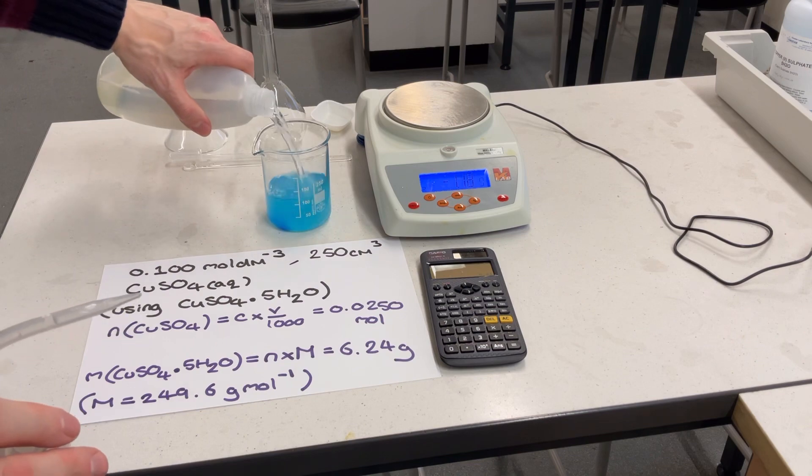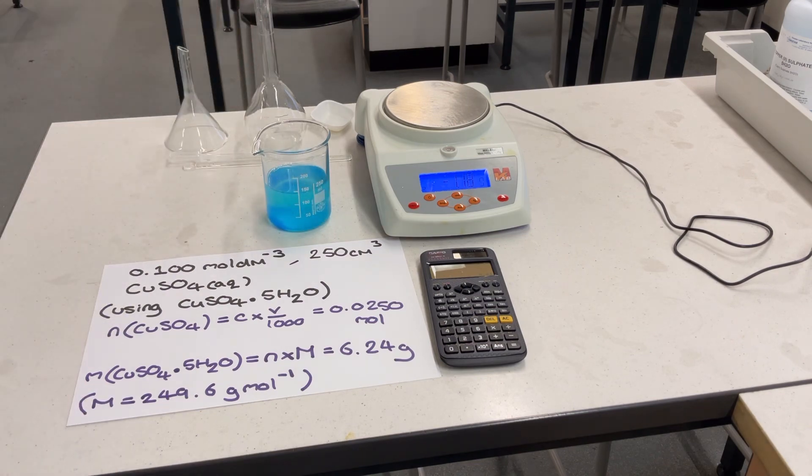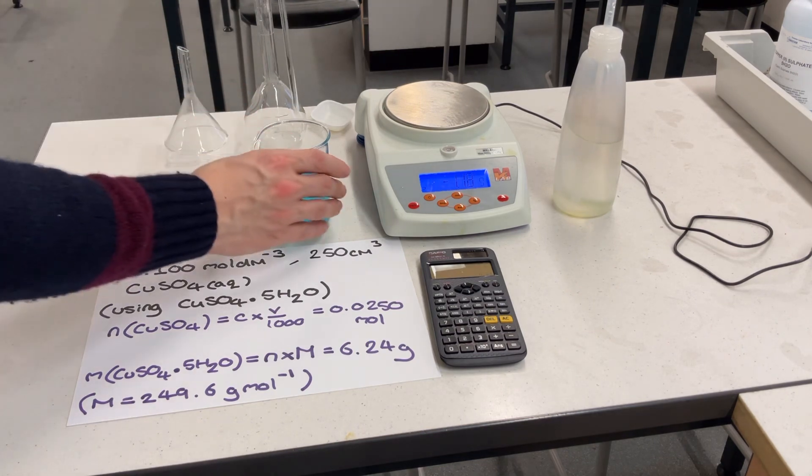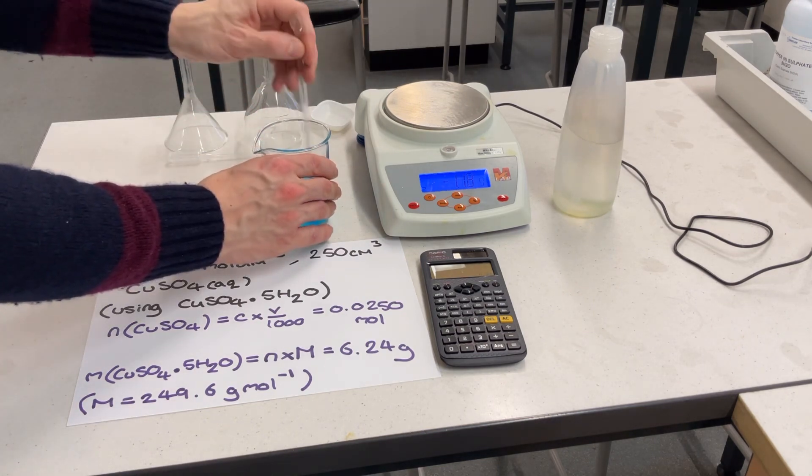On a side note here, I often get asked about how much water you should use for this. If you're preparing a 250 centimetre cubed standard solution, I recommend using around 150 centimetres cubed of water at this stage.